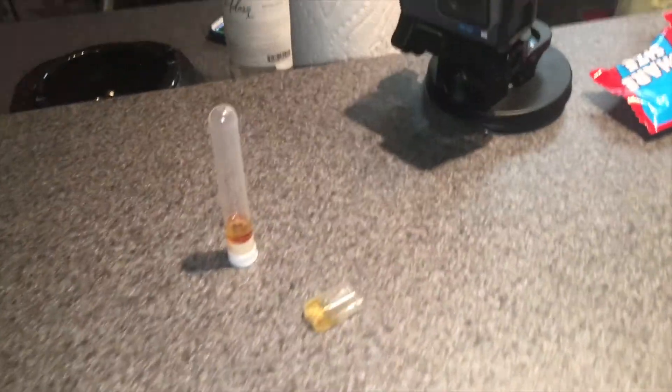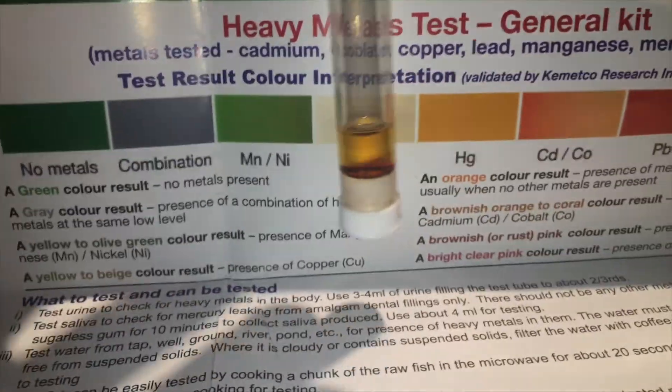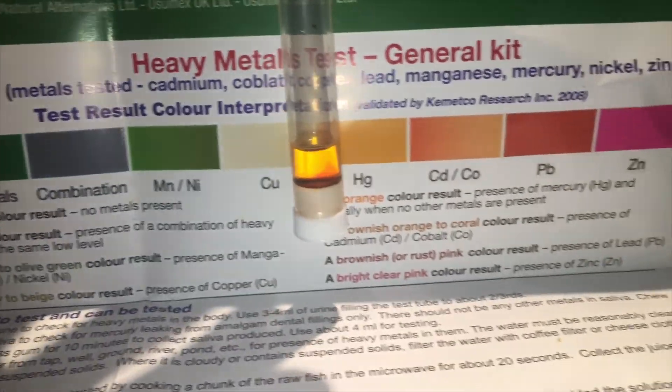Alright, so it's been about 20 minutes. This is what we got. It kind of looks like mercury, not going to lie. HG. So here we go.